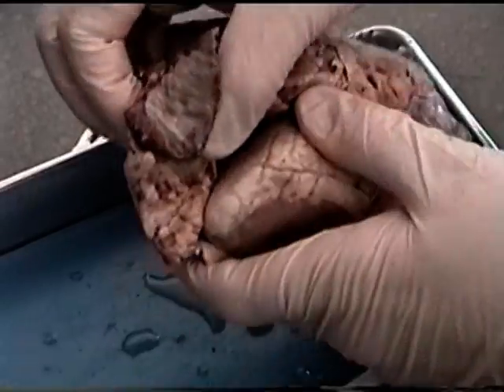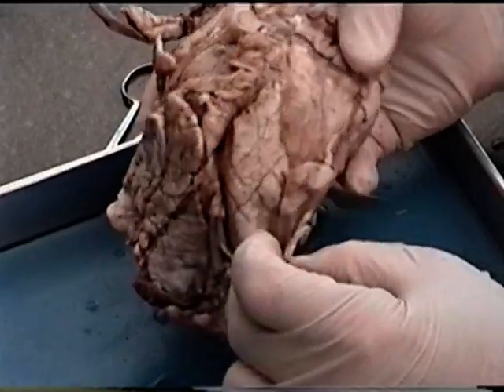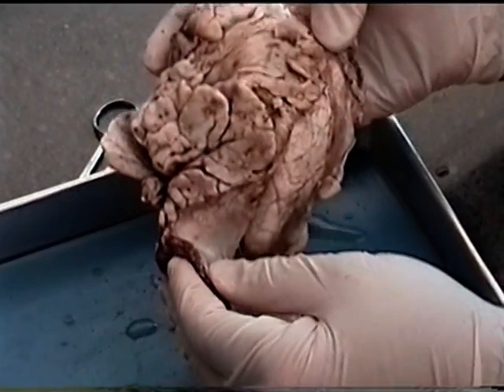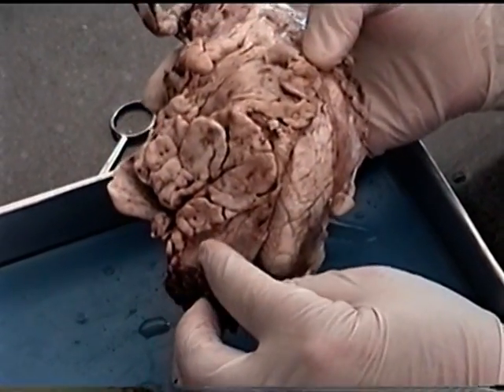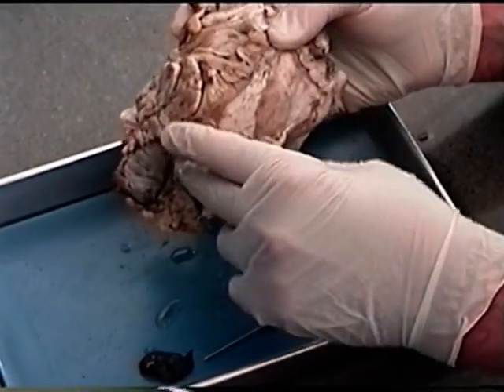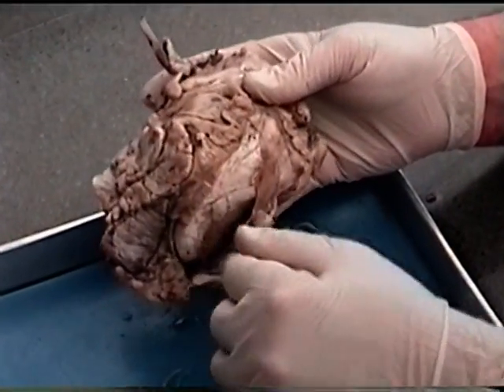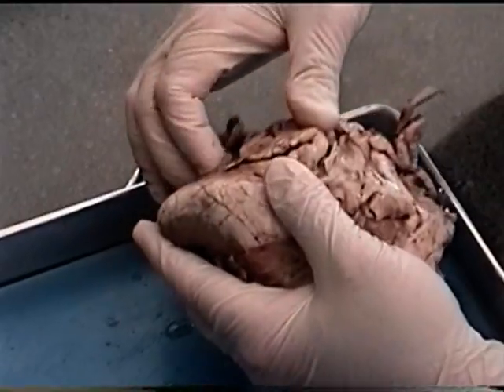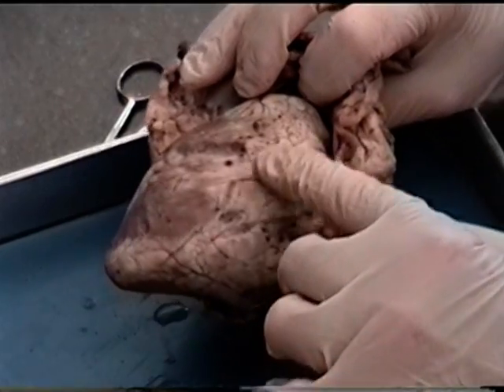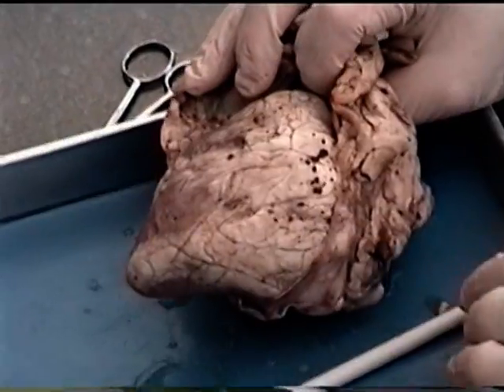Just as a review again, the heart exists within a pericardial sac. The outer part of the pericardial sac is the fibrous pericardium that attaches to the diaphragm and keeps the heart in place. As we pull the pericardial sac away, the space is the pericardial cavity. It would, in a person, contain a fluid we'd call pericardial fluid. And as we pull that sac away from the heart, we can see that the heart is covered by a shiny membrane that we would say is the visceral pericardium or the epicardium.